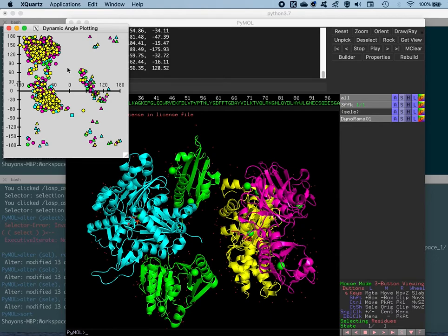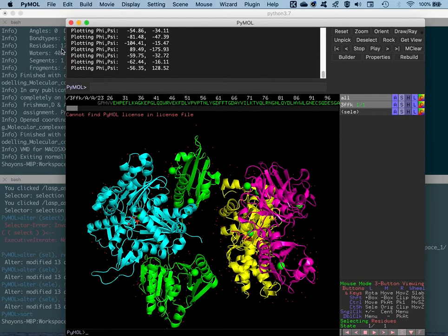So another thing that we can do, and this will be very handy, is coloring it according to the secondary structures, so that it's easier for you to recognize based on the residue types as well as the corresponding secondary structure that it occupies. And this is kind of a cross-check with what we already did before, when we didn't color it at all and had a monochrome, a single color that's green. And we basically went ahead and right-clicked on different residues to get their particular positions by bringing them into focus. So we'll close this for the moment and go for a different coloring method.